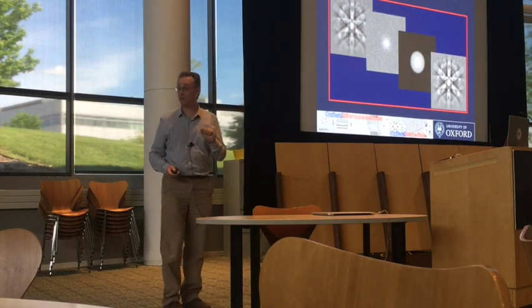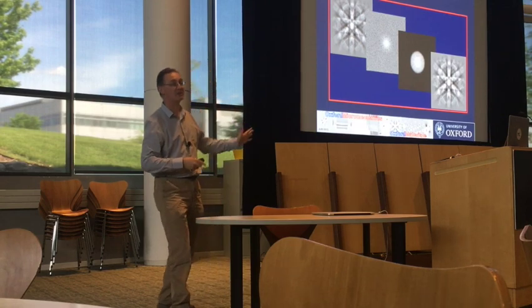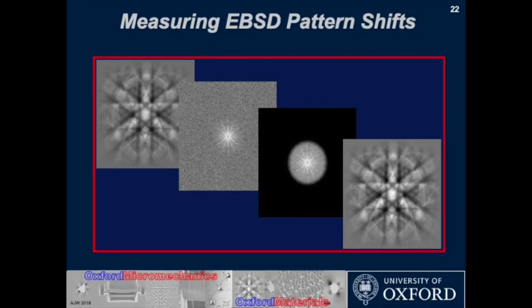Okay. Now it turns out that, although I've described what happens in that cross-correlation in the direct space, it's computationally more efficient to go through a Fourier transform and do it in frequency space. If you know about Fourier transforms, it's fine, you'll understand what I meant. If you don't, don't worry about it, go read the book.